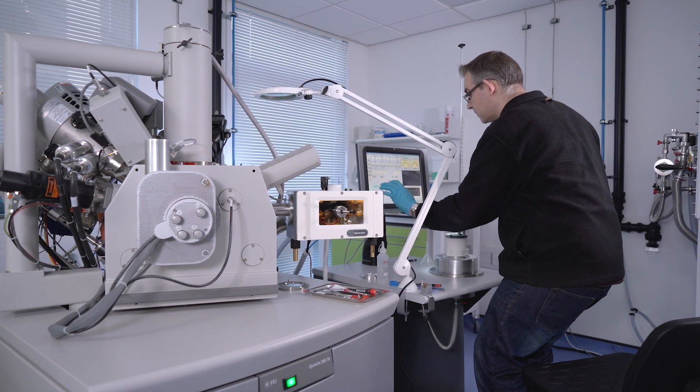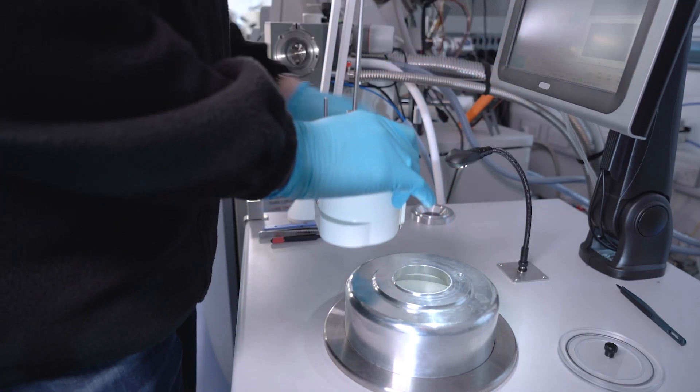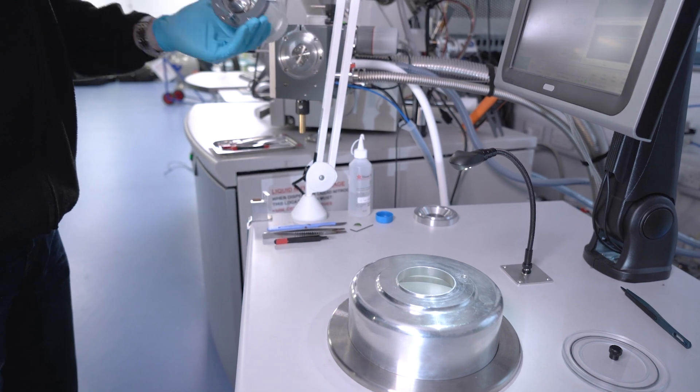Then we vent the slusher and transfer the pot over onto the preparation chamber.